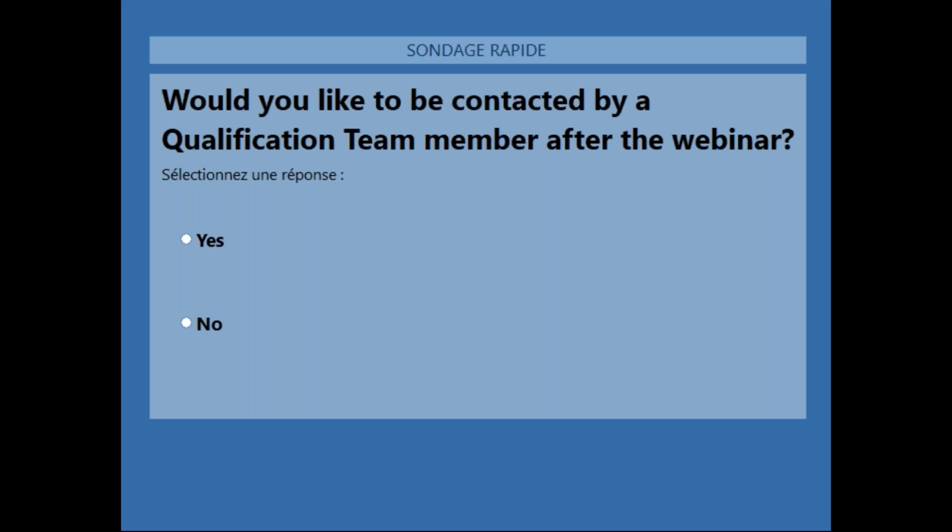We can explore your different use cases together and see how Discngine Qualification can help you in your activities. I left a bit of time for the participants to answer. I think we have almost all the answers. Another few seconds.